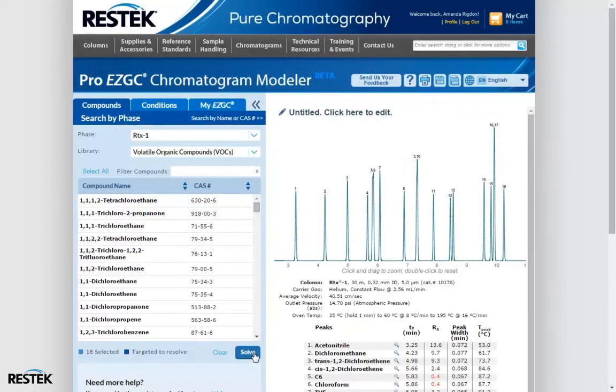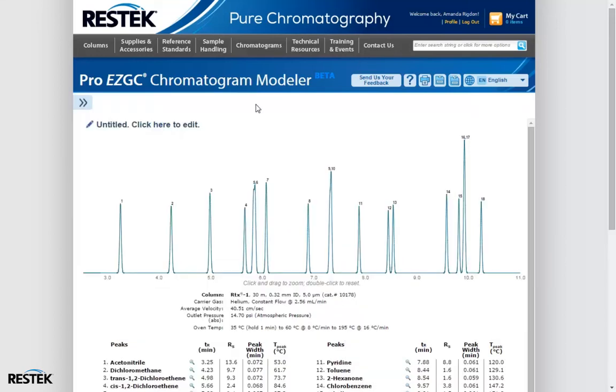Now that we have some results to work with, let's talk about the results pane. The first thing we can do is enlarge the results pane so we can see our beautiful results a little better. All right, so these results aren't particularly beautiful, but they're not terrible either.